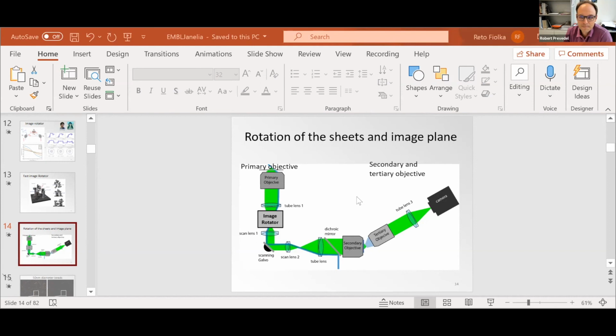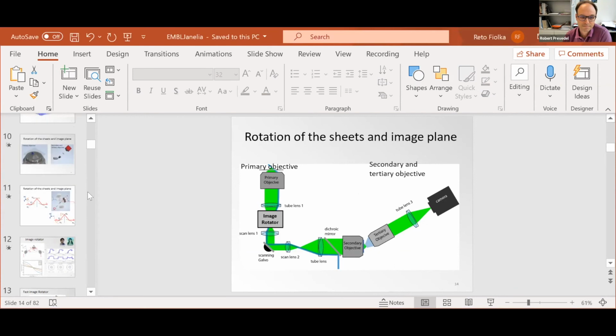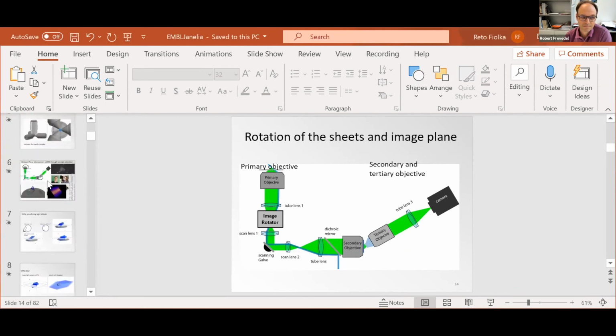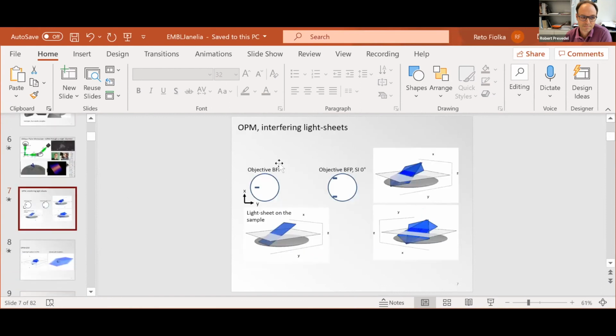And you can, of course, also implement an optical lattice in the sense that you also have periodicity, not only in one dimension, but in the other. The pupil space doesn't allow you to create the same as, you know, let me go, where is their slide?